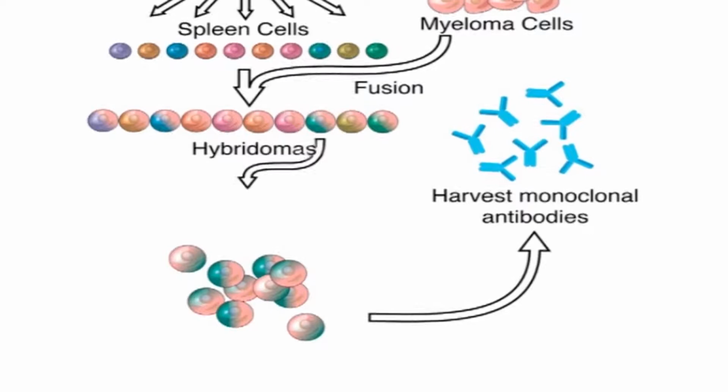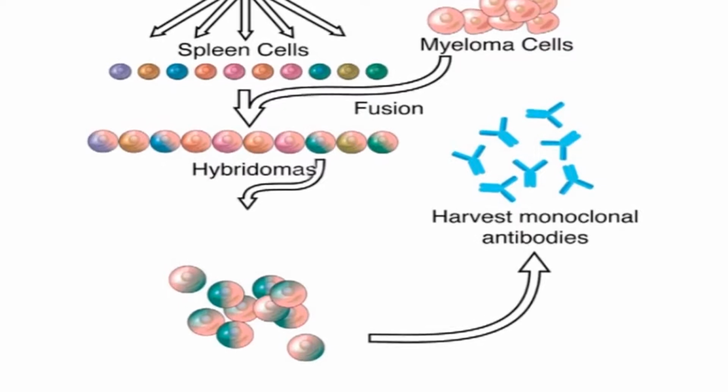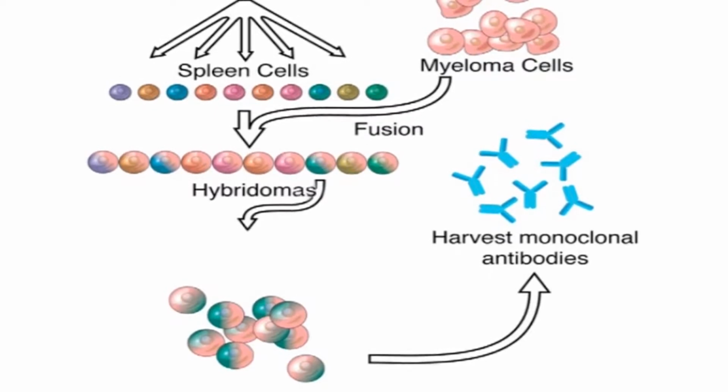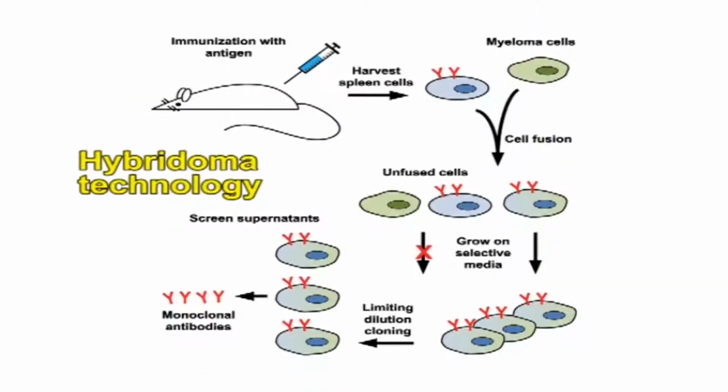Many identical daughter cells can be produced by cloning the hybrid cell which is thus produced. The immune cell product is then secreted by these daughter clones. They are called monoclonal antibodies, as these antibodies come from only one type of cell known as the hybridoma cell. The advantage of this process is that it combines two different types of cell qualities, that is the ability to grow continually without any interruption and the production of large amounts of pure antibodies.